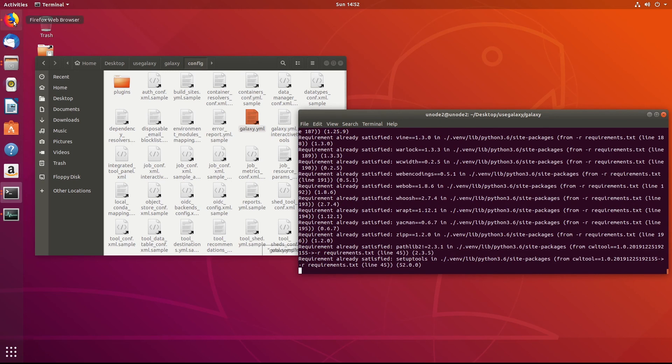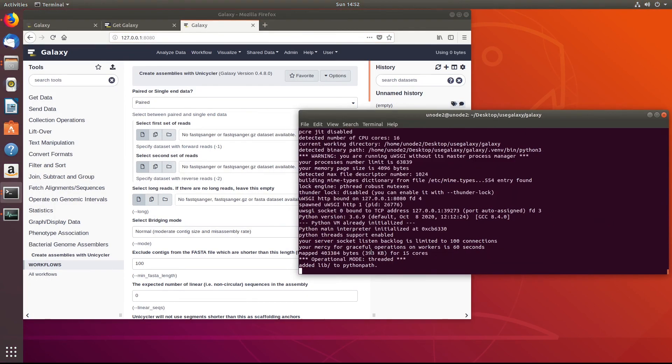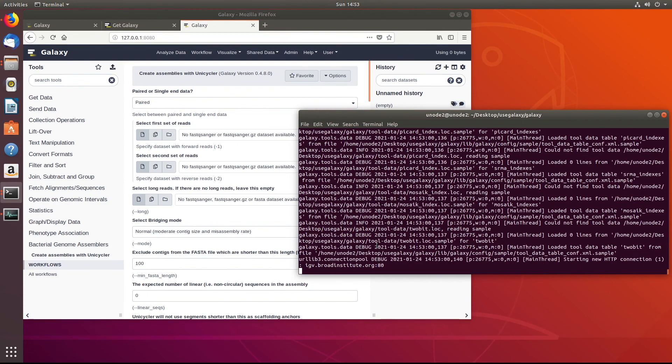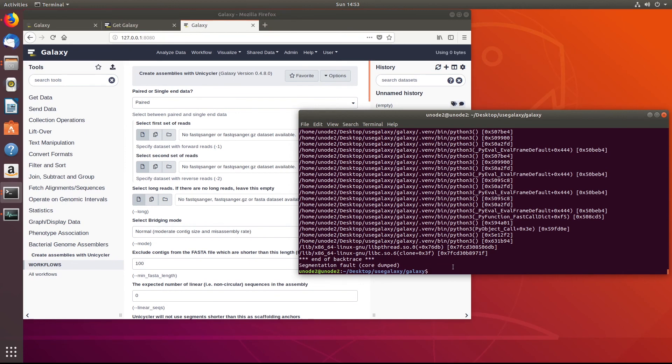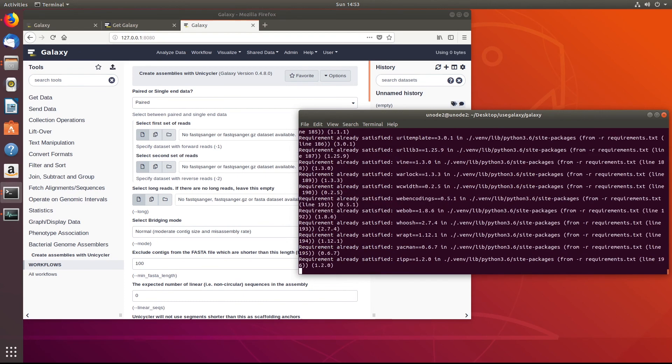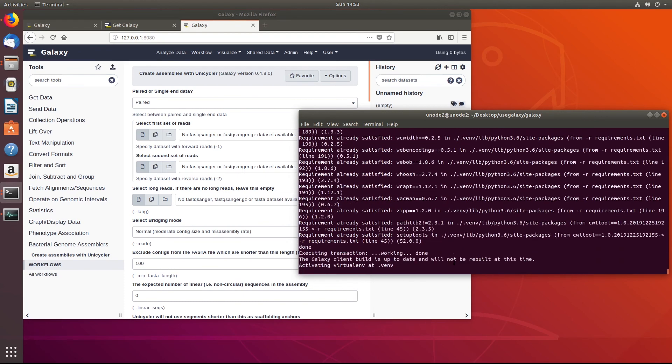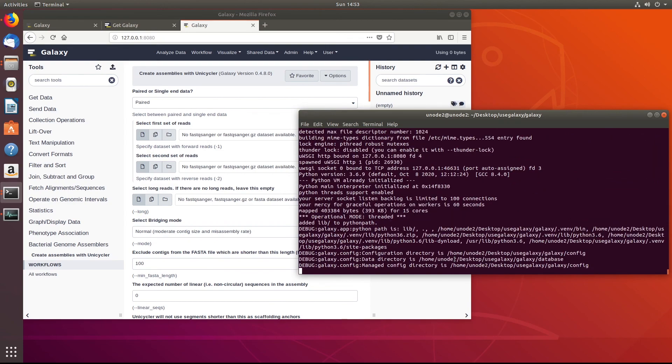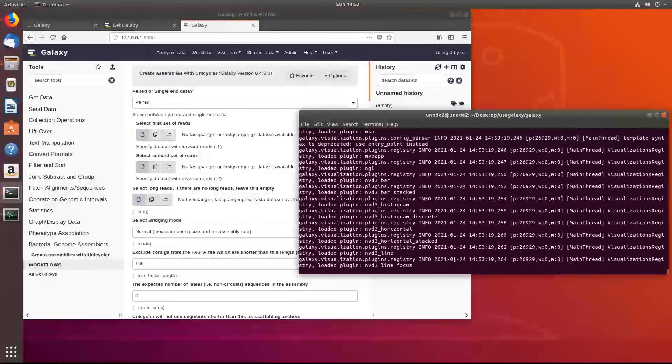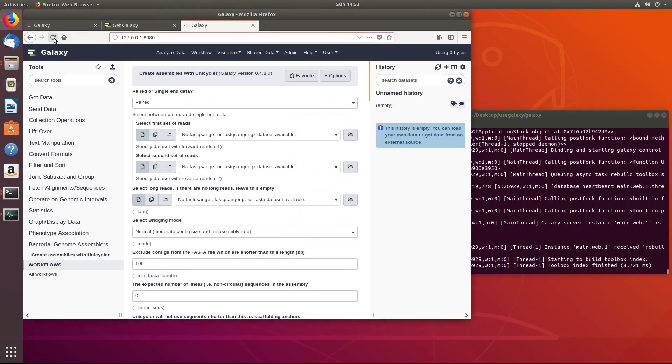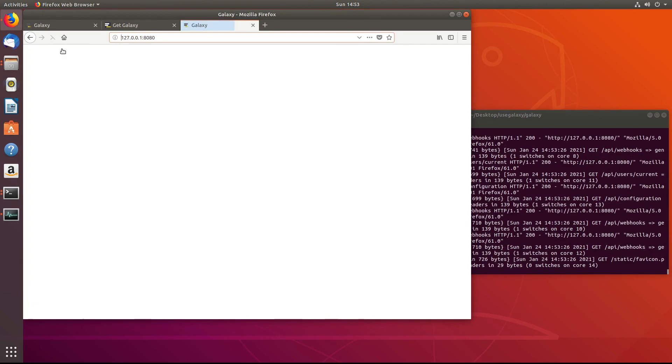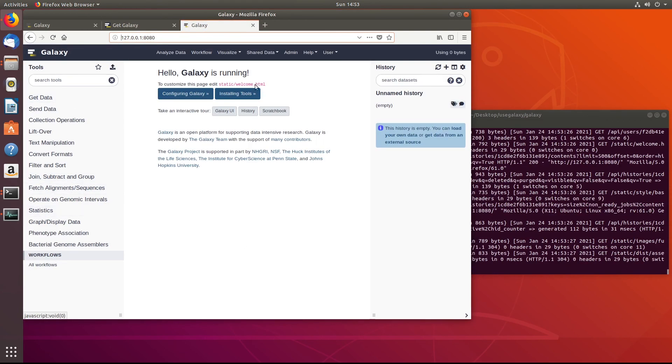Let me go back up here once it tells us that it's running and backtrace. There we go. So now we have our URL, which is the same thing over here. If we refresh it, we should be good to go with 16 threads.